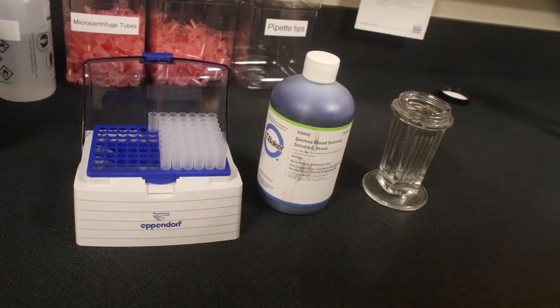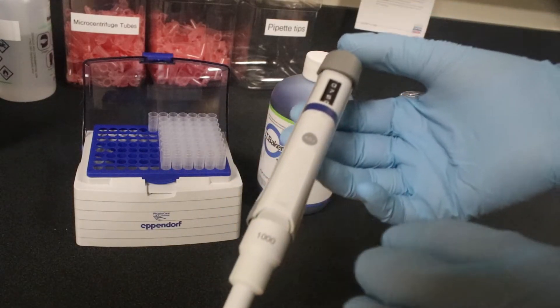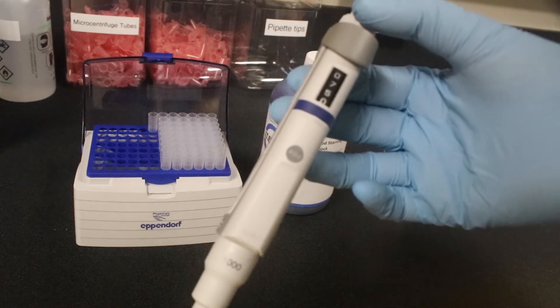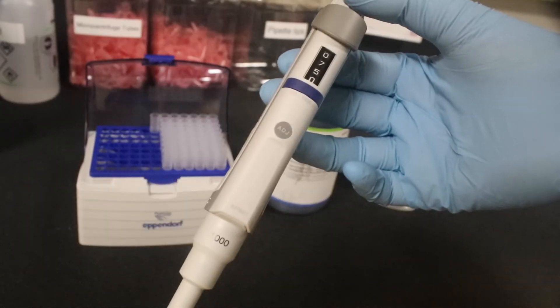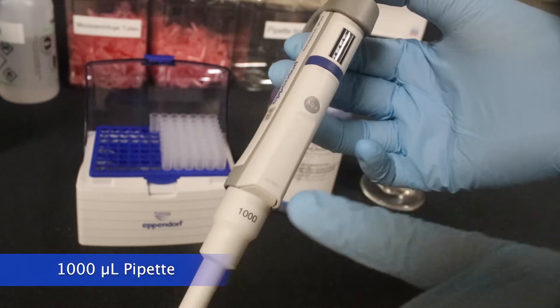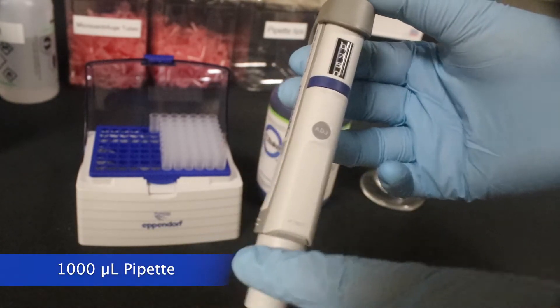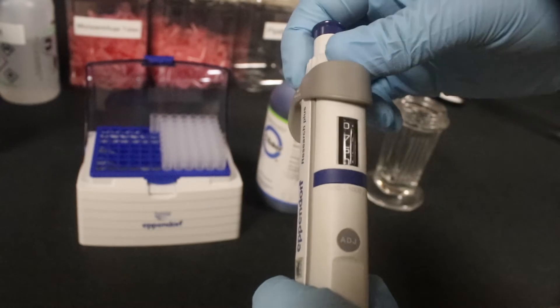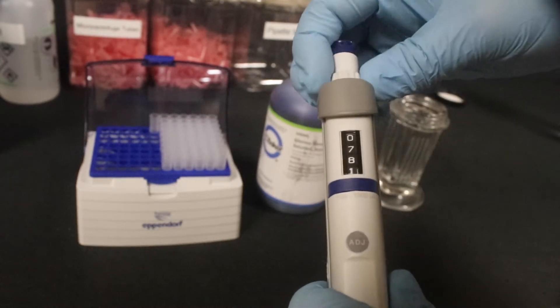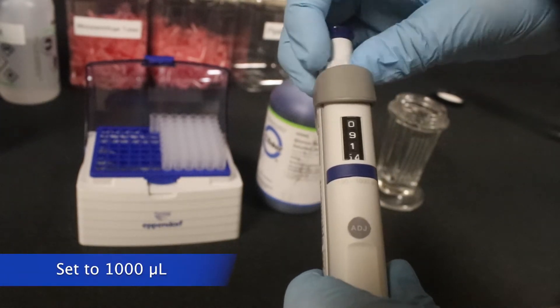Now, the first step is going to be to put the concentrated Giemsa stain into the Coplin jar that will then dilute with water. But first, grab the 1,000 microliter pipette and set it to 1 milliliter or 1,000 microliters.